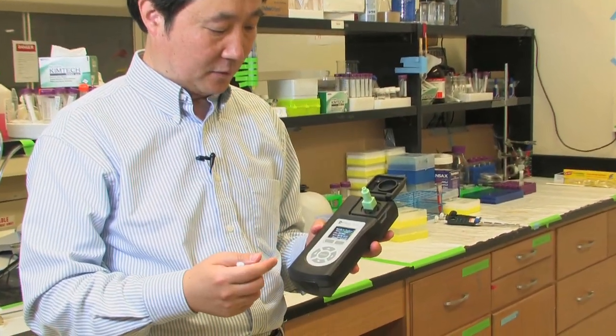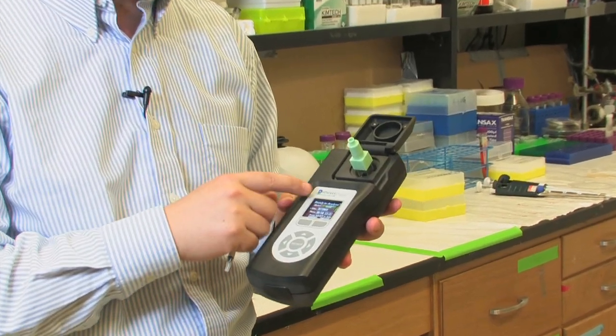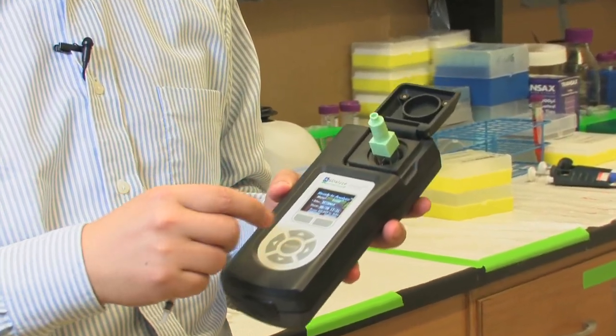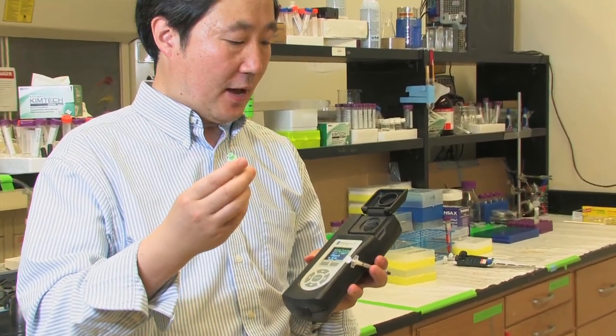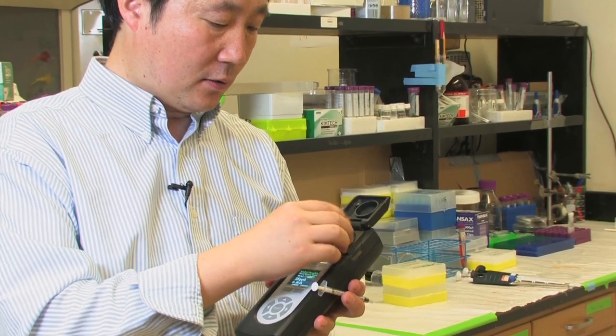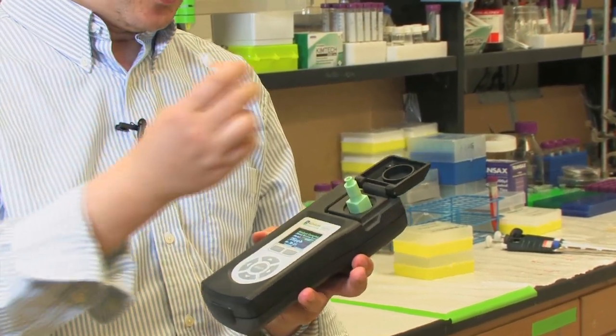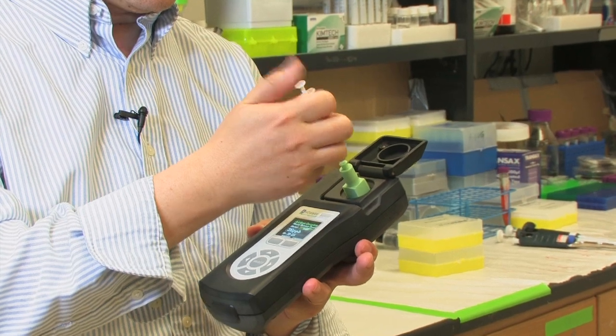This is the latest product that I developed based on our technology at Beckman and the University of Illinois, working together with a local startup company called Andalyze. This is a portable fluorometer. This is the cartridge that contains the sensor we developed. You put it in here, and then put in a sample solution of interest and push through.